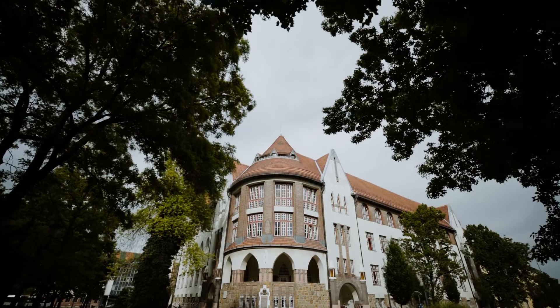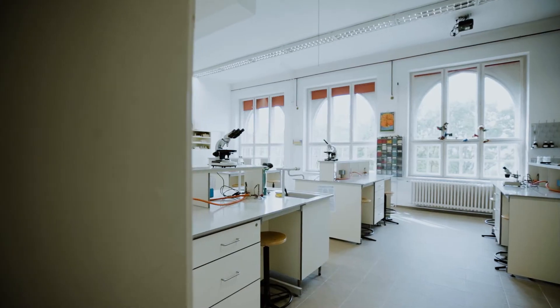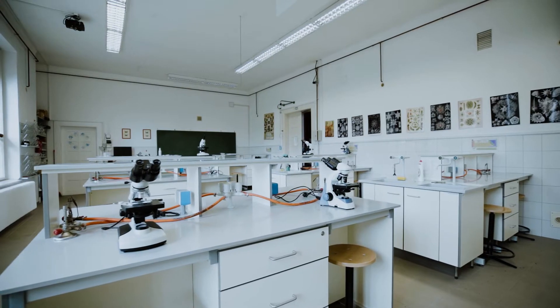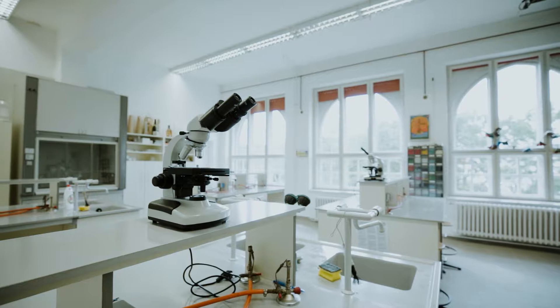Nálunk a Kecskeméti Református Gimnáziumban a kémia, biológia labor, előadó és a hozzátartozó kiszolgáló helyiségek kicsit olyanok, mint hogyha egyetemen lennénk. Olyan a megjelenésük, felszereltségük és a hozzátartozó kollégák is.